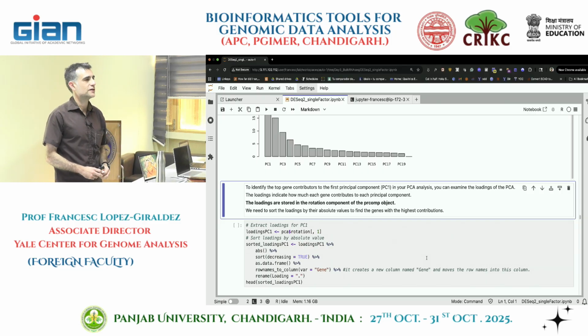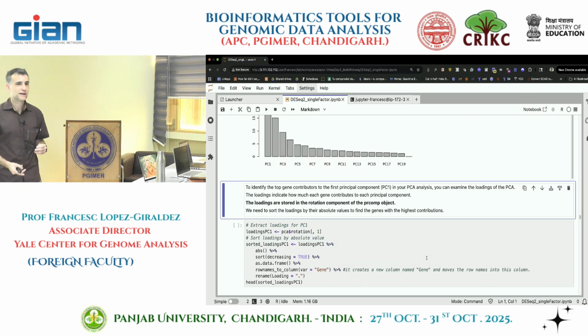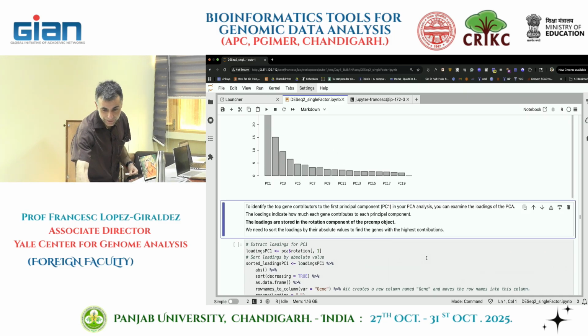So should we stop here? Okay, any questions about principal components? How we plot them? I gave you two options. If you like ggplot and you want to learn, use Bonnie's notebook to practice, or ChatGPT. Don't use my example because I also make mistakes, right?